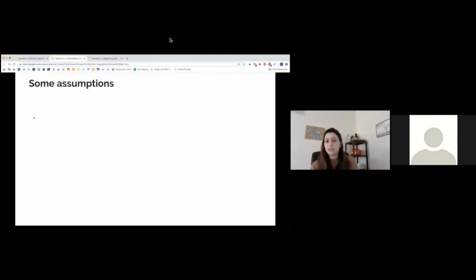So to do the quantification, we have to make some assumptions. And these assumptions are that you have a high library complexity. What does that mean? That means that the number of molecules you have in the library is much greater than the number of sequence molecules you actually recovered. So as you could see from that previous slide, circled were the reads that you captured, but the actual fragments of molecules that were present in your sample are much more abundant. So you only took a snapshot, a sample of a much larger pool of molecules.